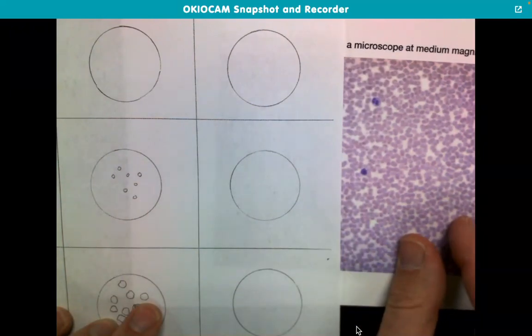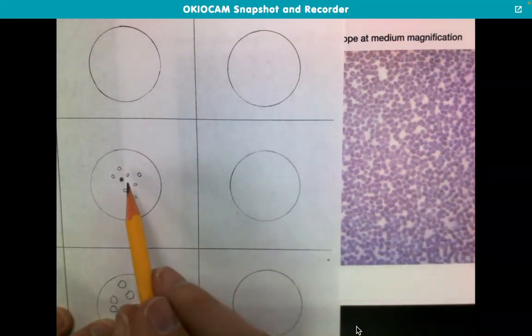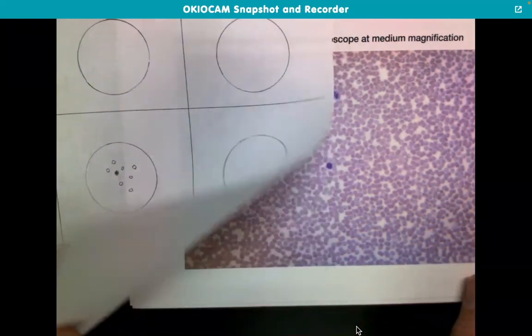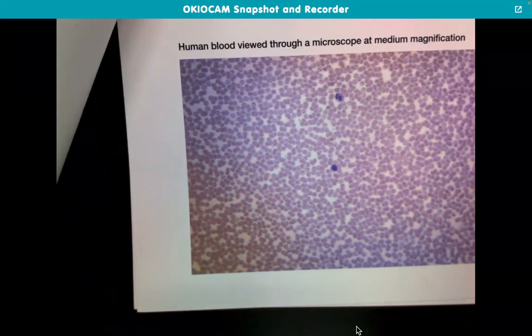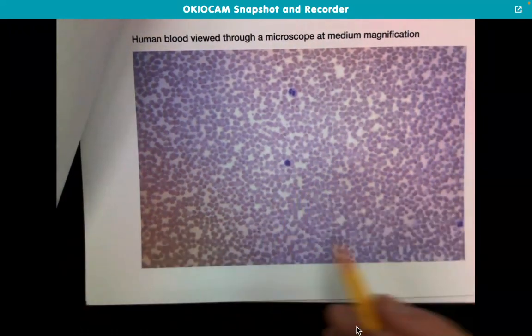And I did have some purple ones, so I'm going to add one of those in. Also, I'm not trying to draw 50 filled in purple ones. I don't see that many. And this whole picture is only 3 of them. Here's the third one over here. So I only see 3 dark ones and a lot of lighter ones.